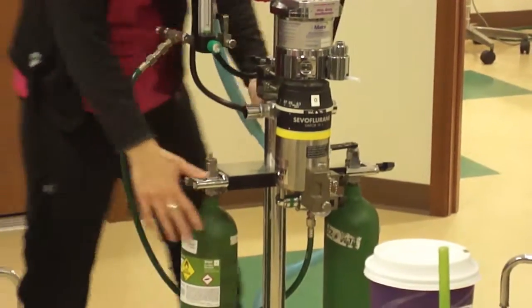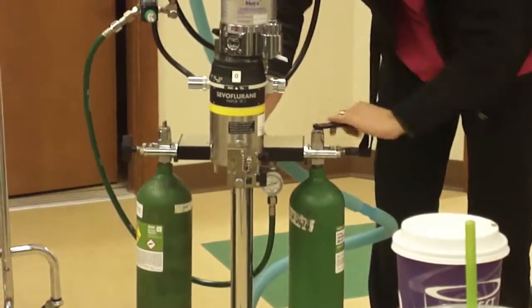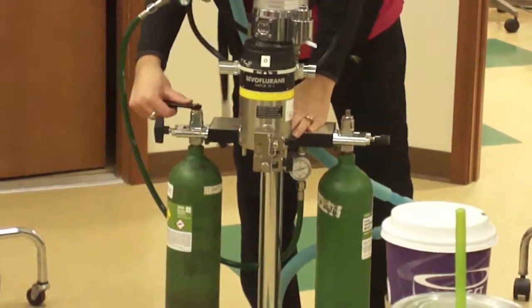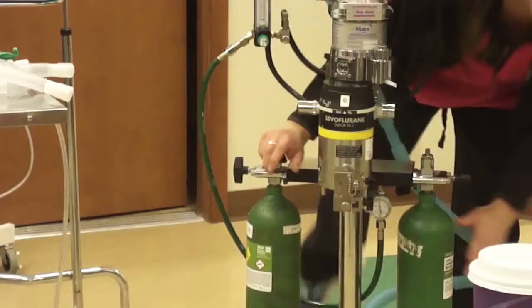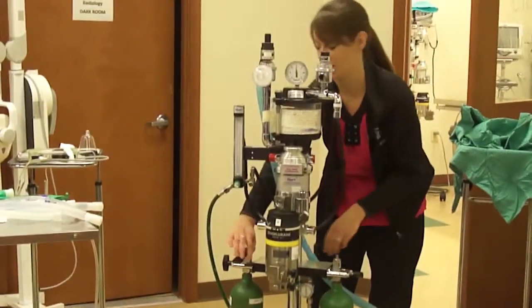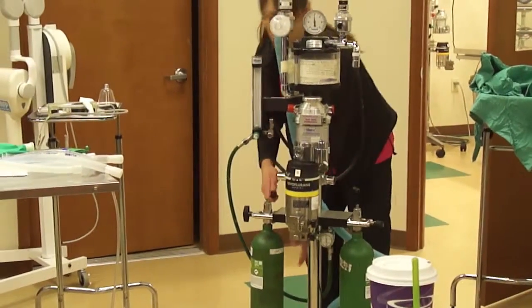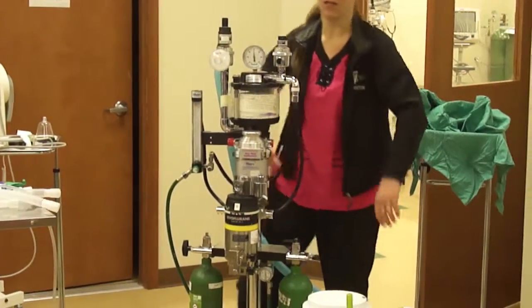So if I need to switch to this one, I'm going to turn this one off. Oops, wrong way. Turn this one on. Let's see, am I right? 18? Oh yeah, right. So now we have a full tank over here. I'll leave this on. We'll put a piece of tape on it that says full, so we know this is the one we're using right now.